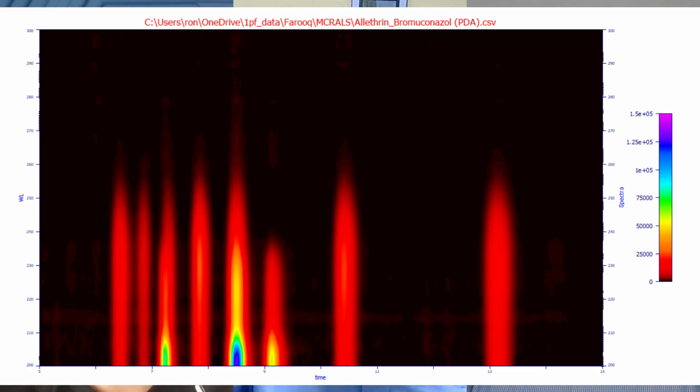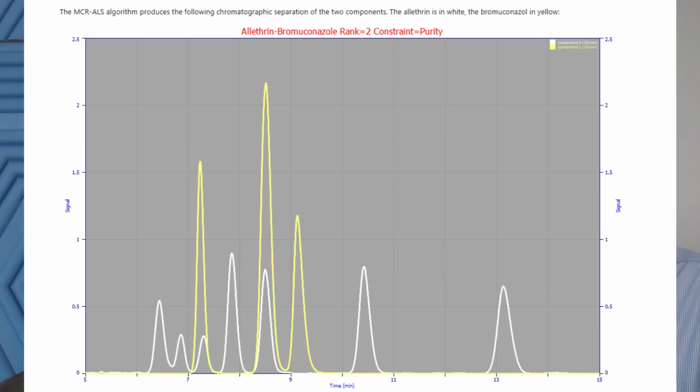But there are techniques, and what I'm showing you here, this particular method produced two individual components. You see the yellow component, you see the white component. It's doing a beautiful job of showing you each of the 2 molecules and the stereoisomers that you're capable of registering in the separation. But even one of these has 4, one of these has 8. In these separations, you see a 3 and a 7, simply because 2 of these are co-eluting and coming out in the chromatography in the same place. You can get into some pretty sophisticated technologies, but you're very much looking at the present time.